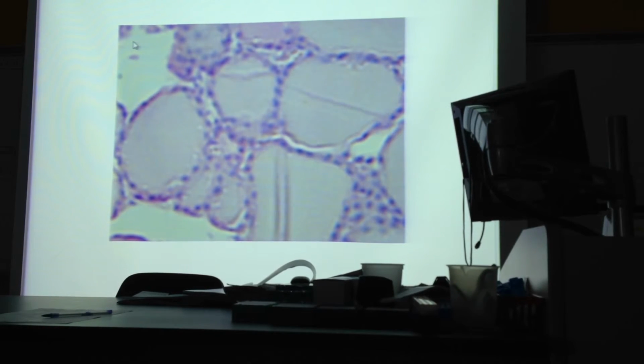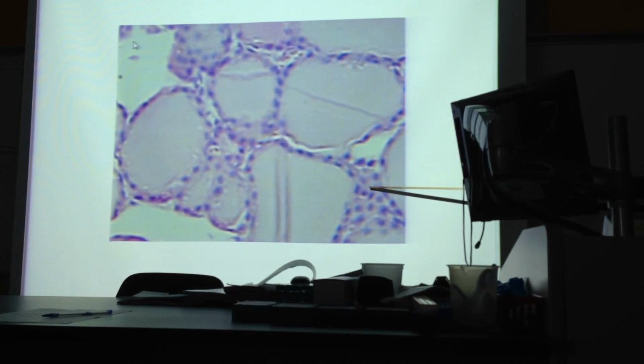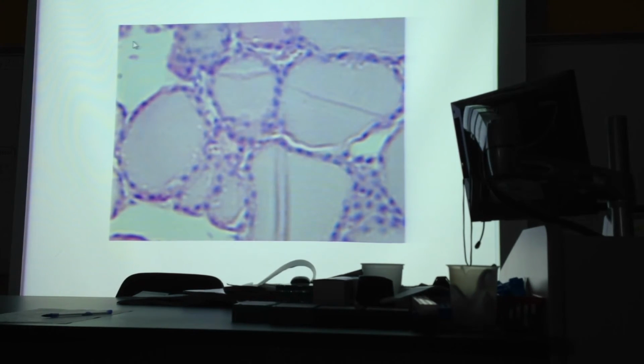Okay, so T3 and T4 regulate your basal metabolic rate, how fast you burn the calories, your oxygen use, your breakdown of fats and glucose, protein synthesis, and so on. All right, there are also some other cells in the thyroid called parafollicular cells. And they're in the tissue here between the thyroid follicles. You see the nucleus of them here. These are parafollicular cells. They produce another hormone called calcitonin. That's at the bottom of your hormone handout, calcitonin. What calcitonin does, it lowers calcium ion levels in the blood.